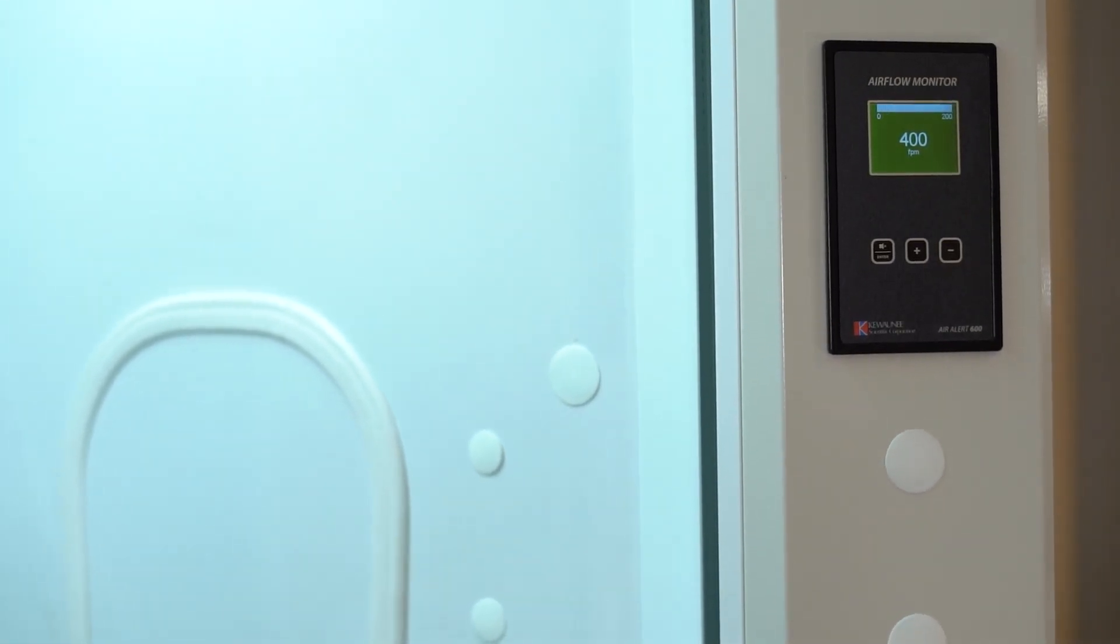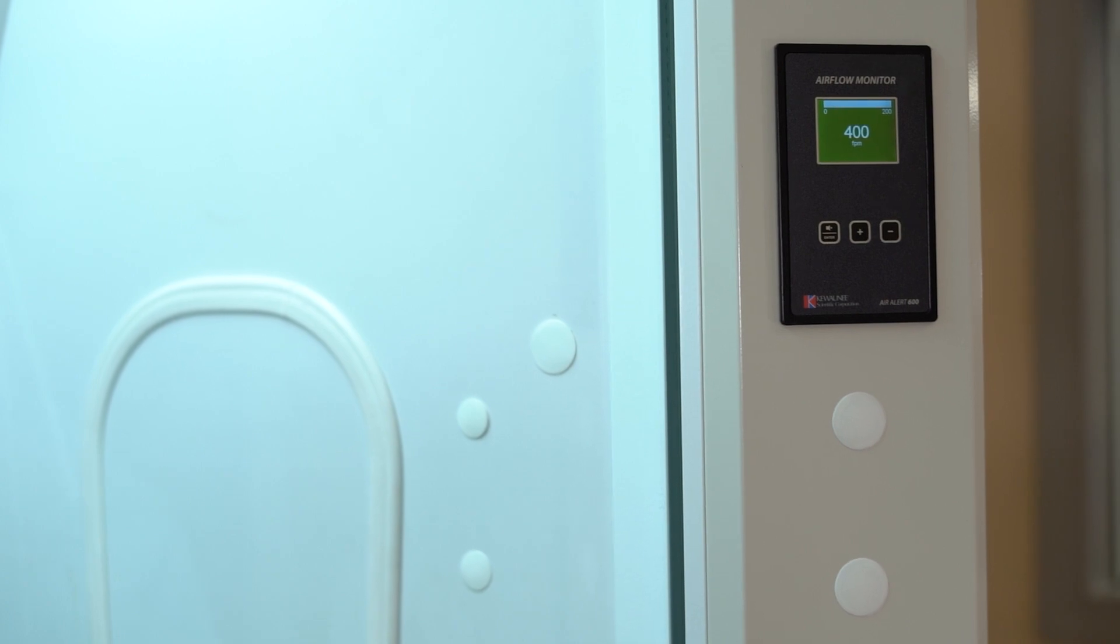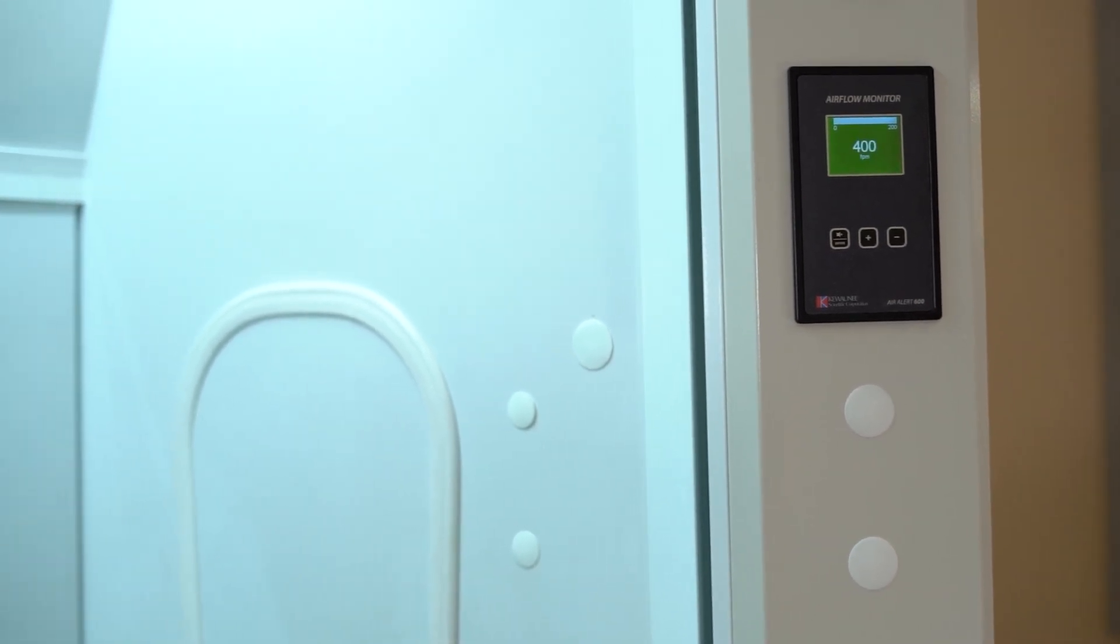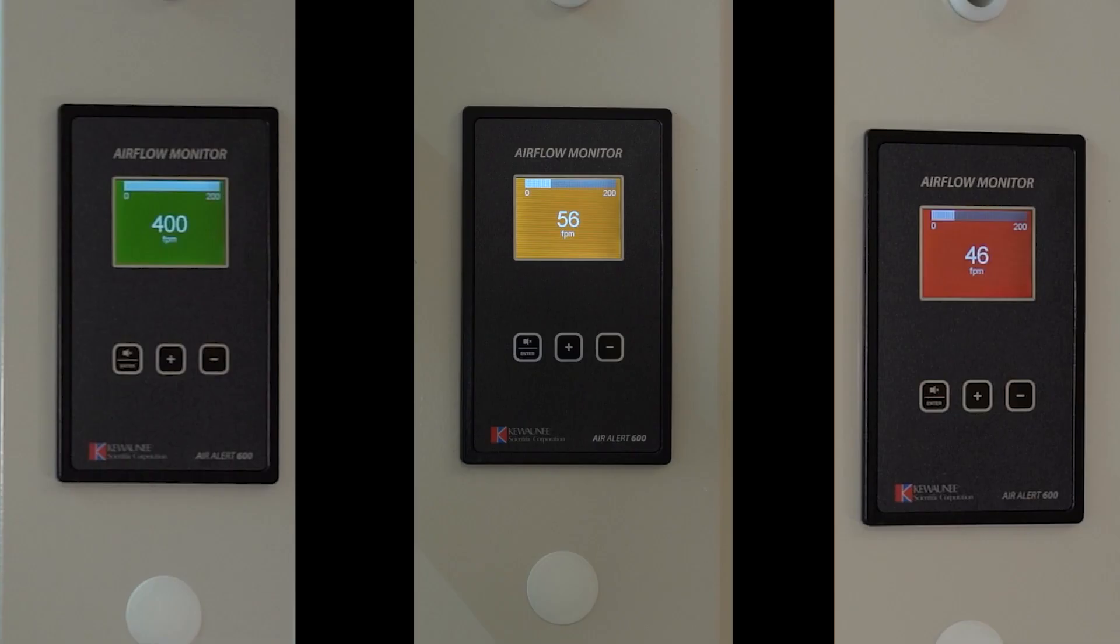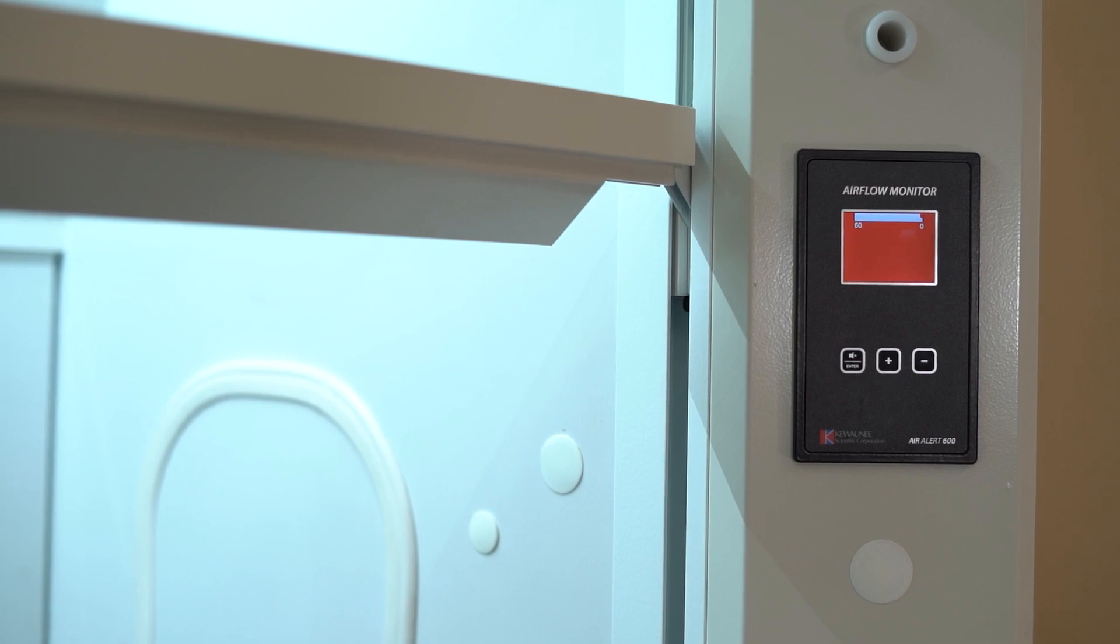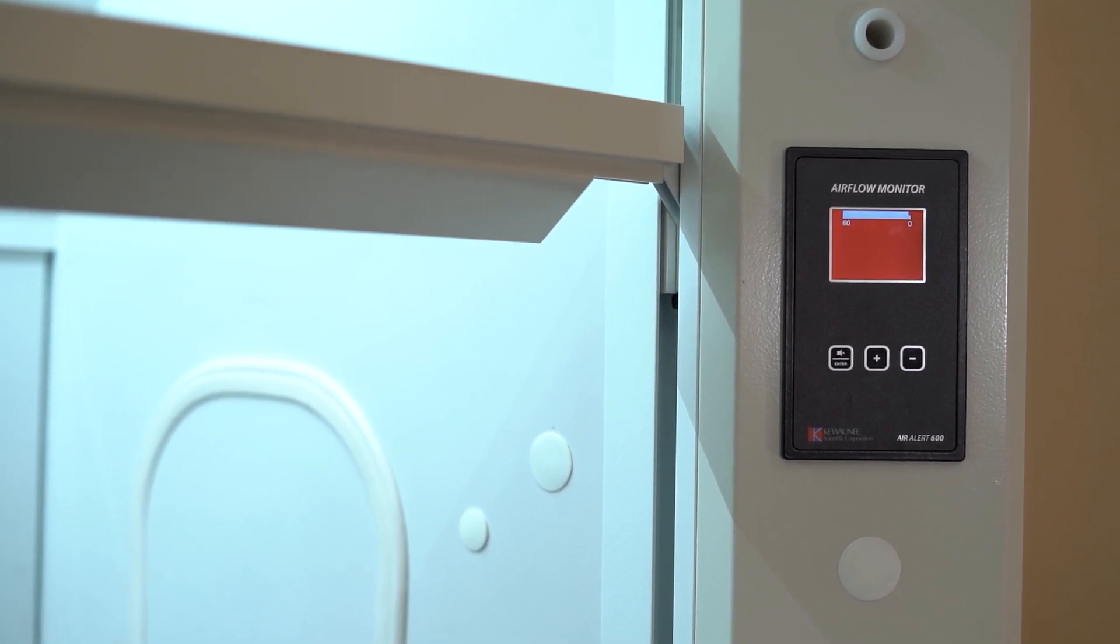This airflow monitor's main function is to show a visual display of the face velocity in feet per minute as well as a colored background depending on preset velocities. Green is a safe state, yellow is warning, red is failure state. There is also an audible alarm during the failure state.